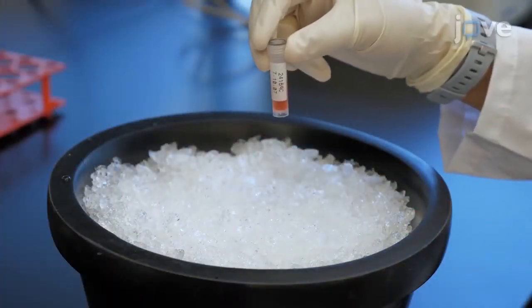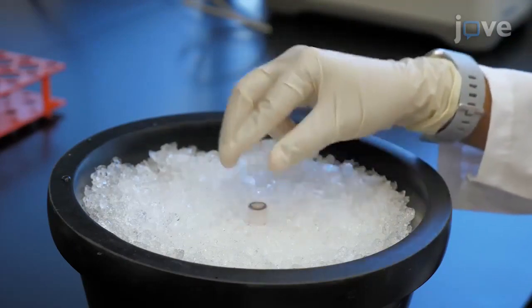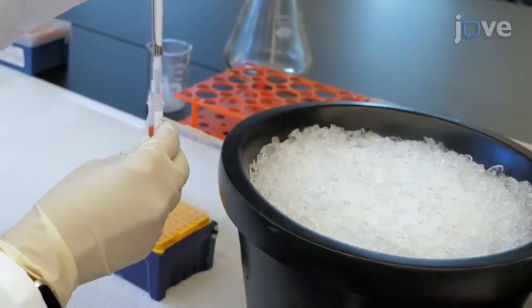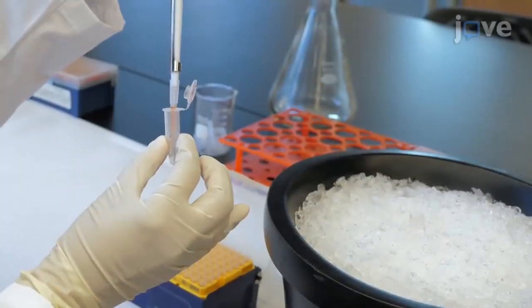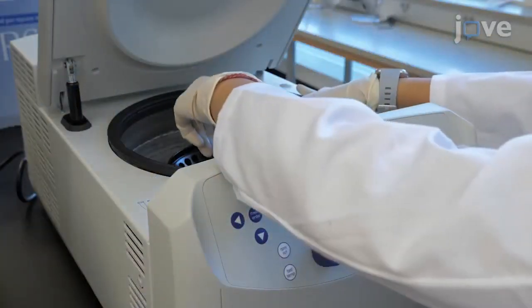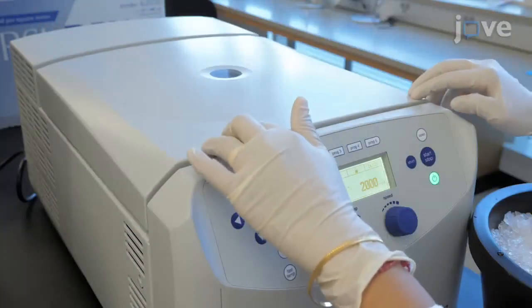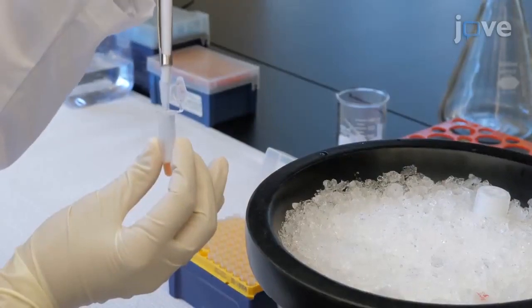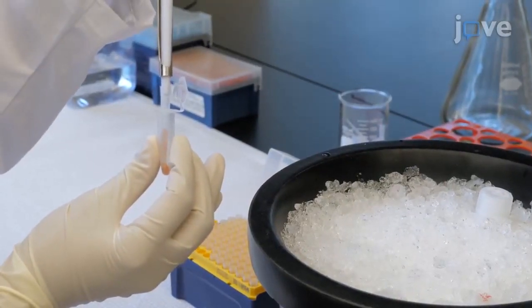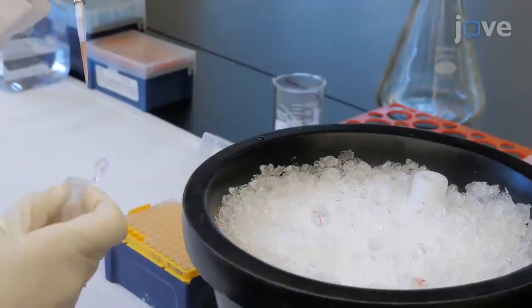Thaw frozen patient serum samples at 4 degrees Celsius. Transfer 110 microliters of thawed serum sample to a tube and spin at 2,000 times G for 30 minutes. Collect the supernatant for subsequent EV or exosome isolation and discard the debris pellet.